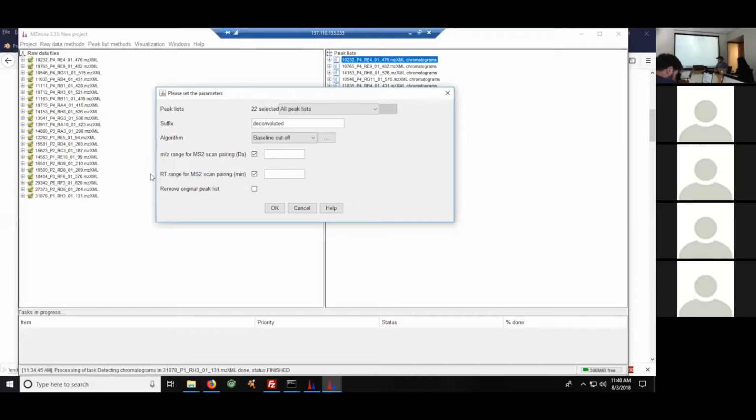That's pretty cool. So with the help from a bunch of undergrads, we here with Louis were able to get this done and integrated into MZmine, which I think was really awesome and enables our entire feature-based molecular networking now.